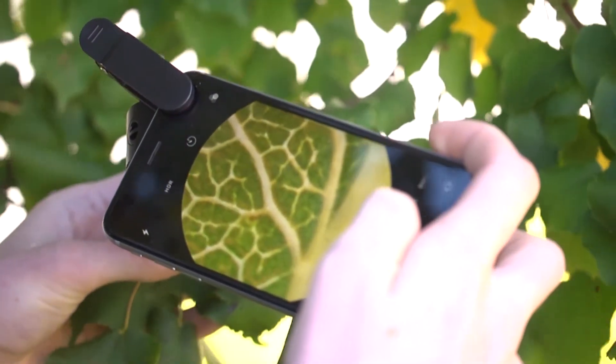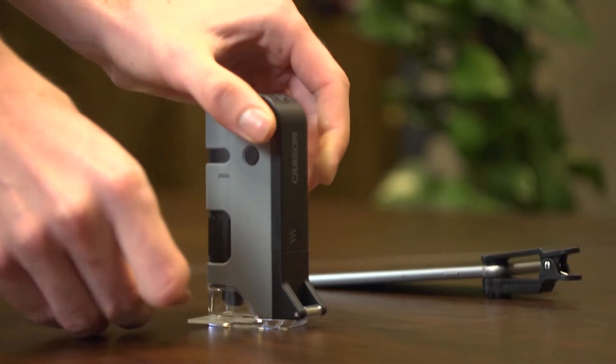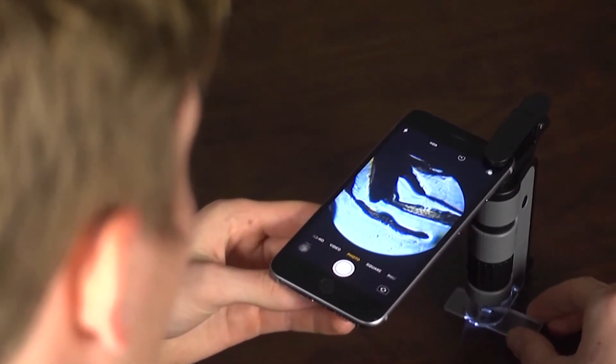I also like how versatile the MicroFlip is. With the LED light turned on you'll be able to get crystal clear results in any lighting condition. When you flip out the base plate, the LED lights will automatically change to a setting that's ideal for viewing different slides.